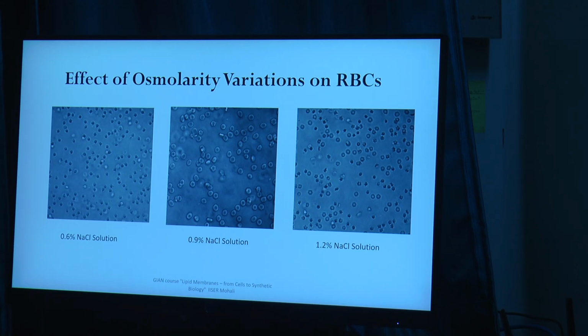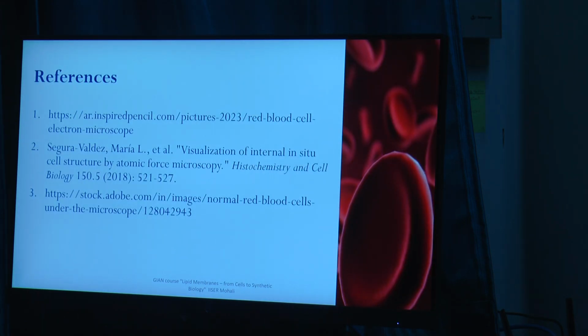What is this, like 1.2%, all this means, how do you add? Is it molarity, or what is the difference between osmolarity and molarity? No, this is like a weight to volume kind of percent. If you are saying 1.2% salt solution, you are taking 1.2 grams of NaCl and putting it in 100 ml. Okay.